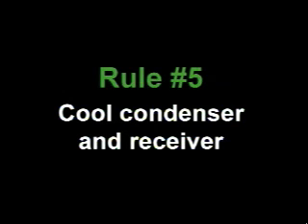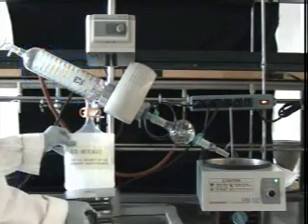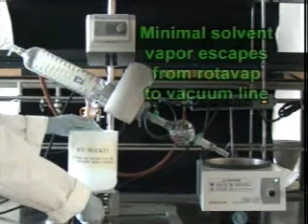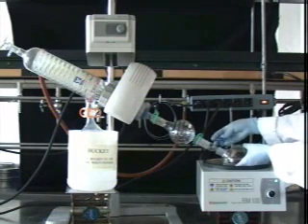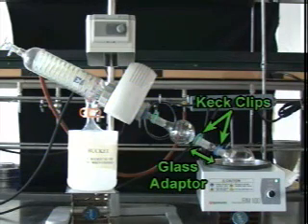But before you attach the bump trap or your flask to the Rotavap, proceed to rule number five. Cool the condenser and the receiver. Make sure that cold water is circulating through the condenser, and place the receiver in an ice bath. This will ensure that minimal solvent vapor makes it out of the Rotavap and into the vacuum line. Now you are ready to put your half-filled, solid-free flask on the Rotavap. Attach your flask securely to the bump trap using a keck clip and an adapter if necessary.